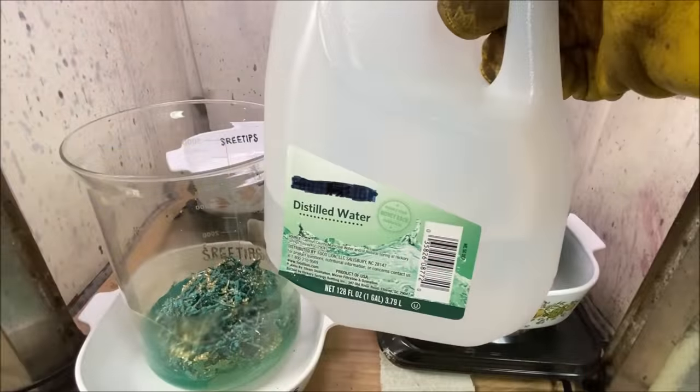It's just copper. And if you look here, I've used 5 bottles. This is a full one. This is the one we'll be using today. But I've used 5 bottles of nitric acid so far in this experiment. Now we can get some room in here, get rid of this hot plate. We're going to combine the material into a single beaker.